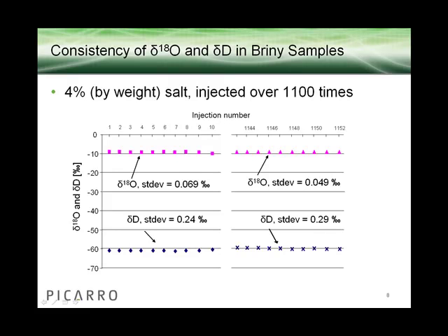Samples containing salts, such as those from oceanographic studies, inland lakes, or boreholes, are also suitable for this technology. Here's a split chart from a series of over 1,100 injections of a 4% by weight salt solution typical of seawater. On the left are delta 18O and delta D values for the first 10 injections.